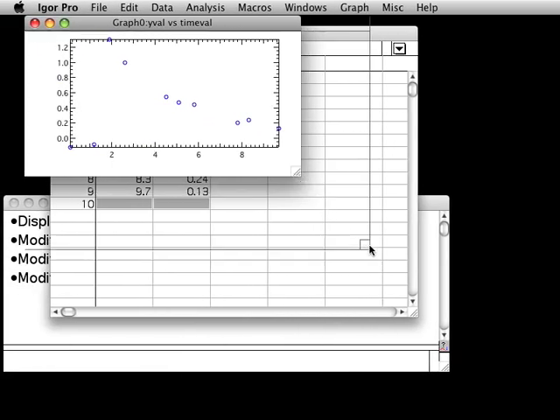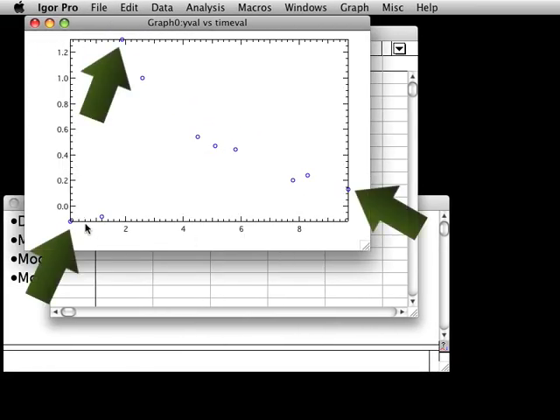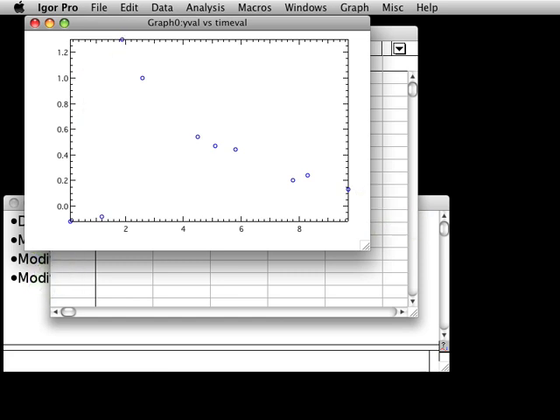Notice that some of the markers now overlap the axis. The Axis Standoff setting, which we just turned off, pushes out the axis so that markers and traces don't overlap the axis. You can use Igor's preferences to ensure this and other settings default to your liking, as I'll show you in a later tutorial.